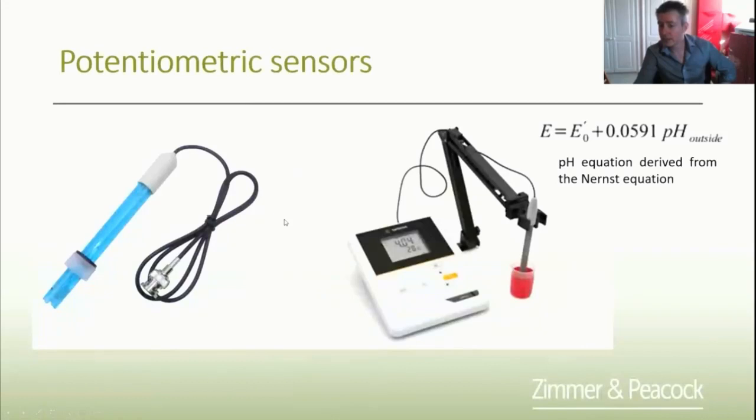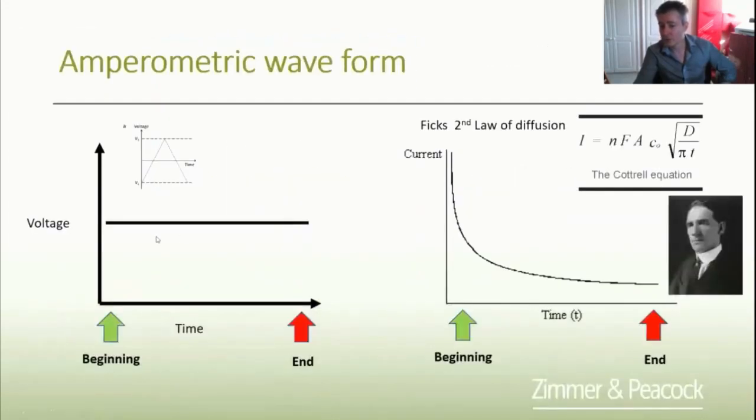And actually, in amperometry, we often choose the voltage which gives us the biggest signal, but the molecules are only diffusing in. So the current drops with time because there's what's called a diffusion limitation. So the current will fall. But in fact, the overall current is proportional to the concentration of the molecule. So it is an analytical technique. It's just unusual that you don't get this nice steady signal. You actually get a signal that falls. And what you do is you integrate underneath the curve, and that integration underneath the curve would be proportional to the original concentration.